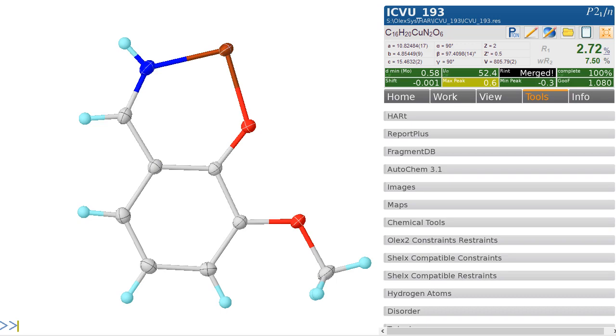Here we've got a very nice structure with an R-factor of 2.72%, and it's a high resolution data set with a very strong I over Sigma.